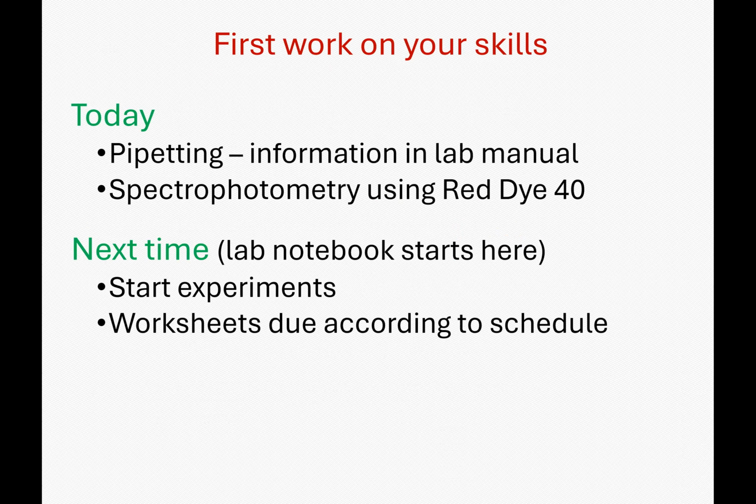We will also learn how to use our spectrophotometers using red dye 40, which is a food coloring, and so it's harmless. Your lab notebook will start next time. We'll also start our experiments next time. The worksheets are due according to the schedule on Canvas.